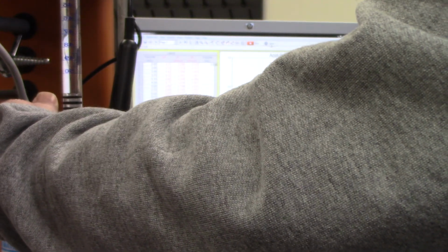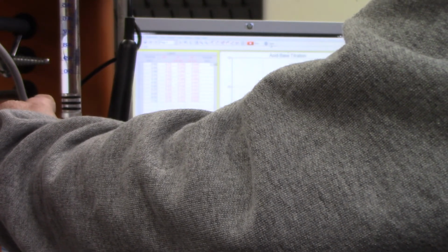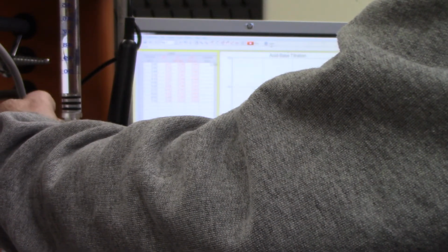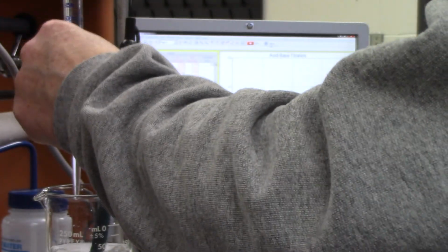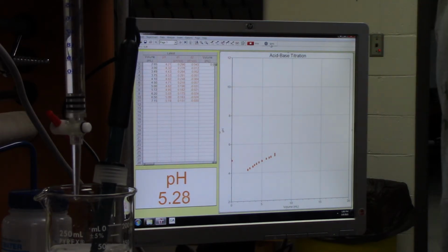Let me go up to 4. I want to go up to 2.9. Okay, volume is 7.75.